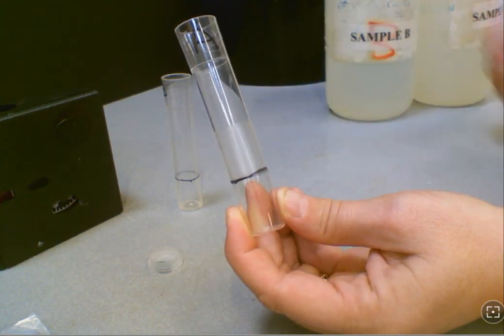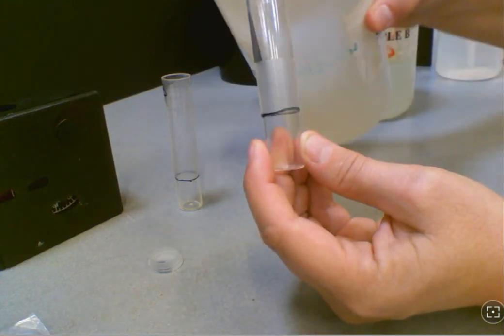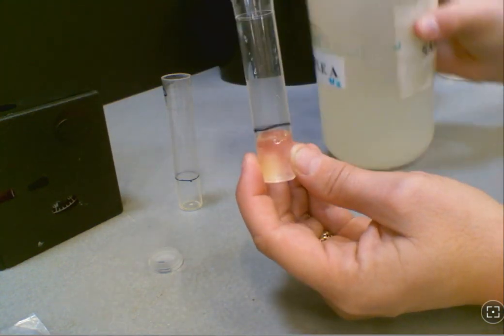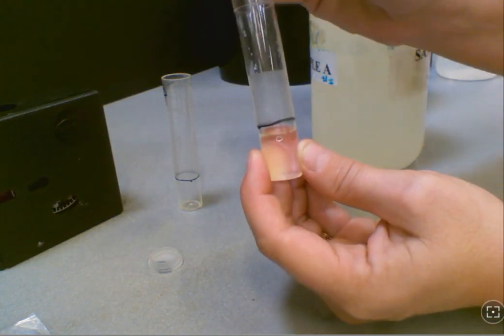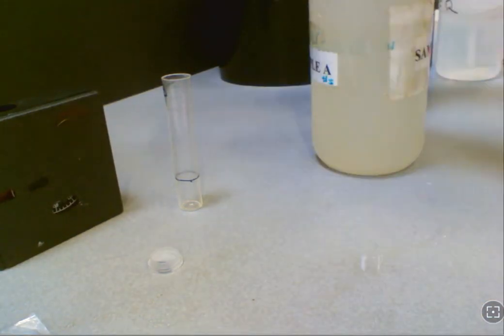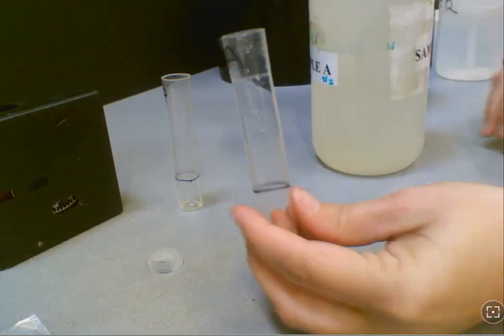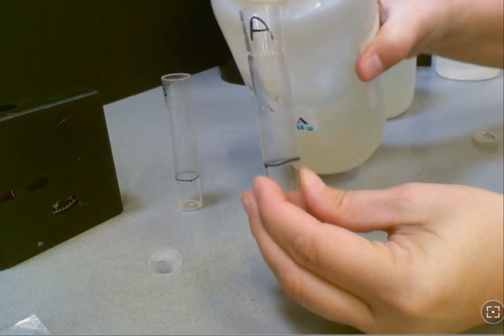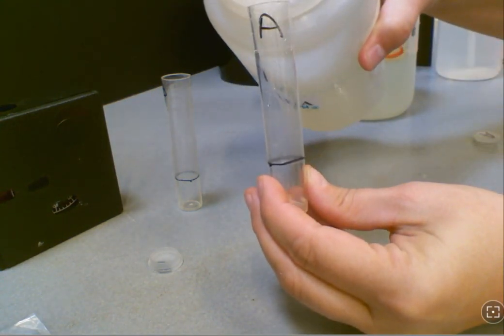Now the first step is to rinse your test tube in sample water, so you're simply just going to put some sample water in it and then pour it back out to get any remaining chemicals or samples out. Once you're finished with that, go ahead and fill up your sample A and your sample B to the line as indicated.